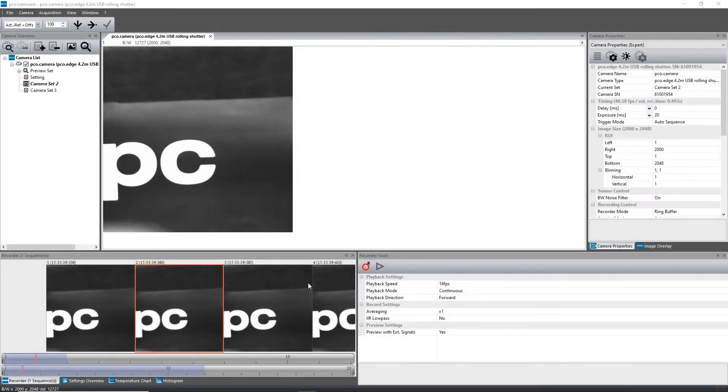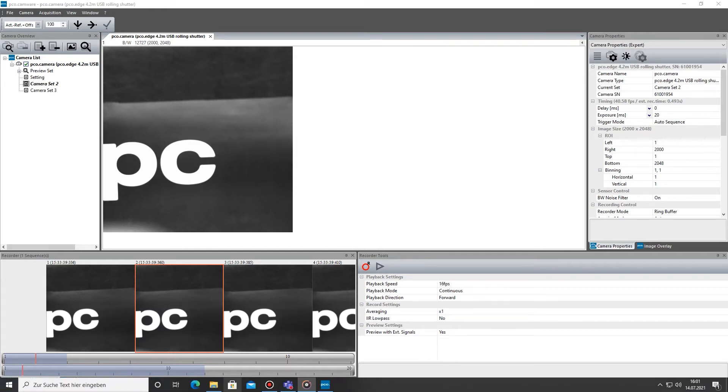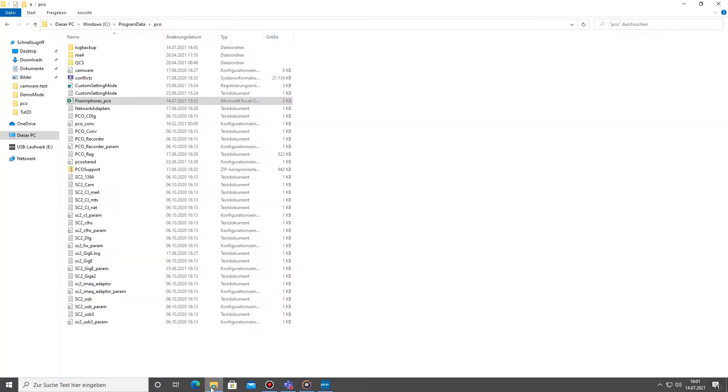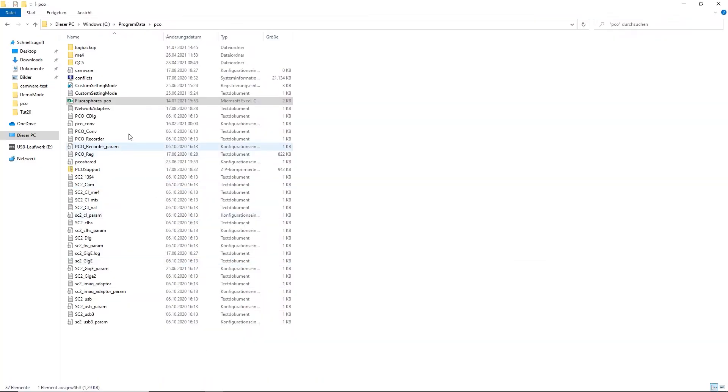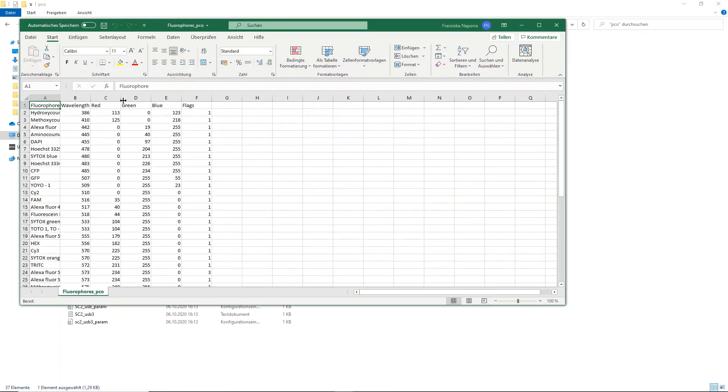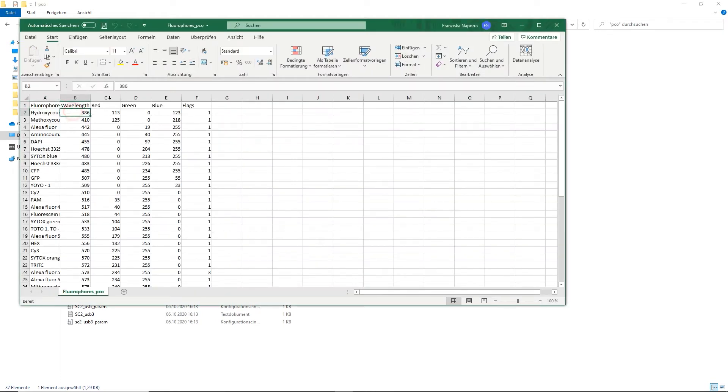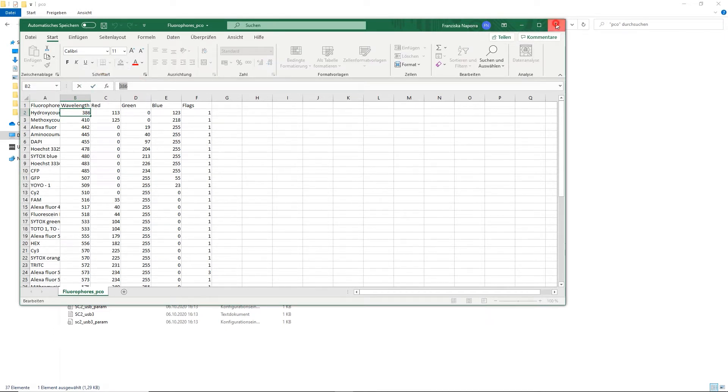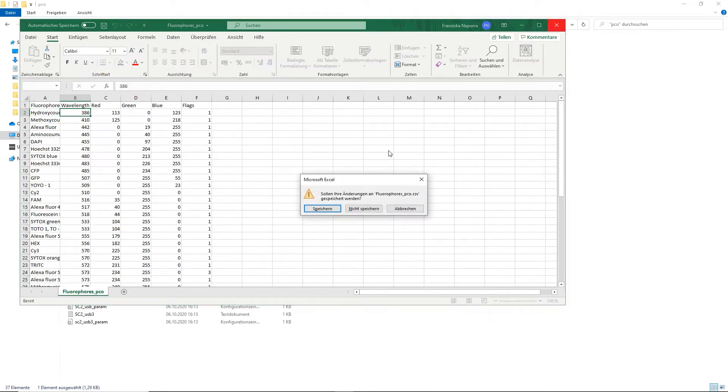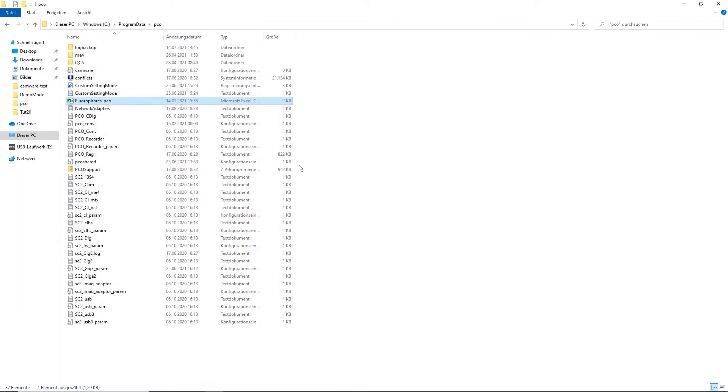For this purpose, CAMWARE provides a list of reference fluorophores. The fluorophores-pco.csv list can be edited specifically for your application. To have full access to this list, it must be copied to the folder on the C drive, program data backslash pco.